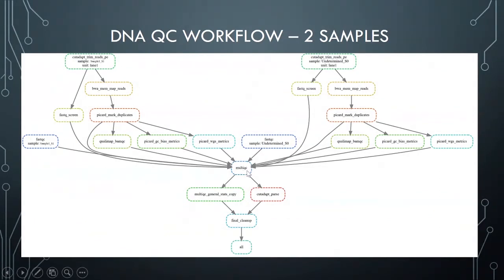in the bioinformatics world. It essentially outputs an HTML file, which is very visual and interactive. So it really gives you a good sense of how your data is performing. And I highly recommend using that for any type of QC and bioinformatics. It's a great way to compile a lot of information into one place.